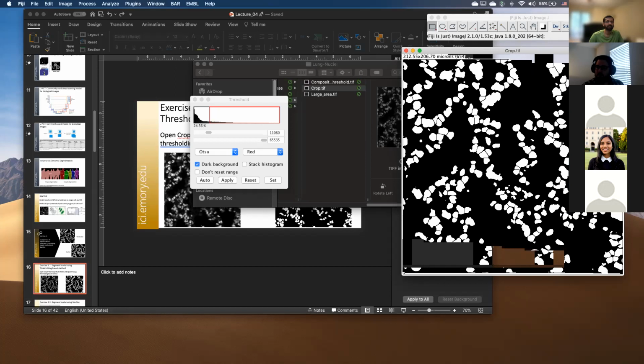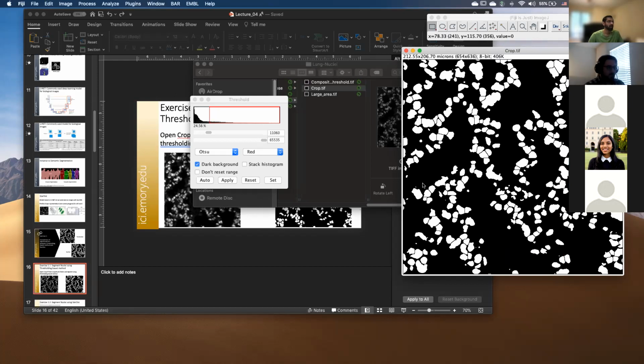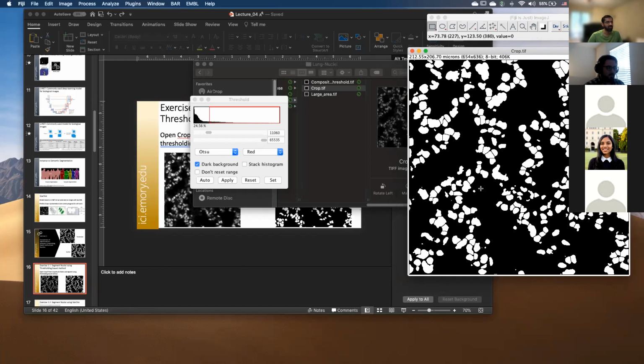Oh, awesome. Okay, so once you are here, I will keep this window open. The goal is to compare how things are faring.